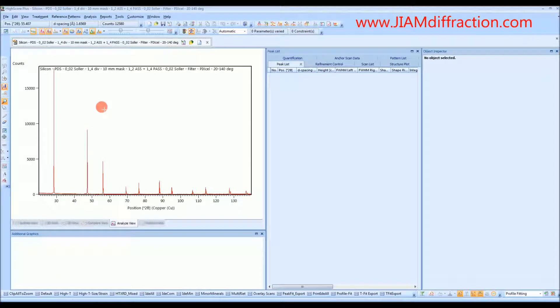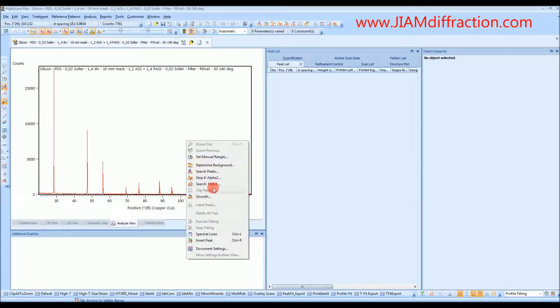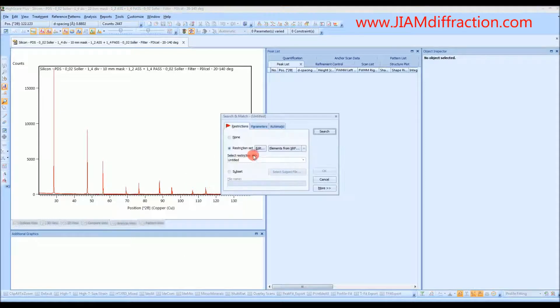Here we have a very nice looking diffraction pattern, and because it's so nice and because we know that there's just silicon in it, I will skip the first two steps covered in the phase identification video — namely background determination and peak searching — because it's really not necessary in this case. So I will just right-click, search match, and edit the restriction set.